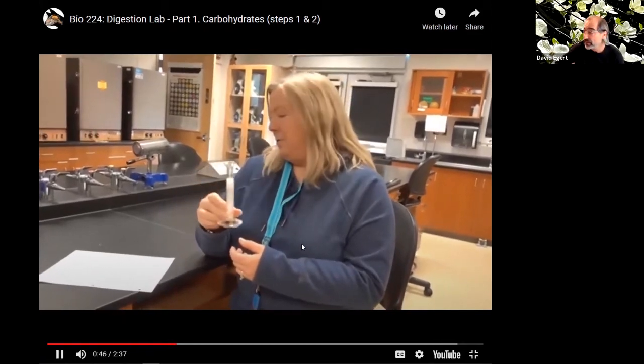Partly I'm showing you because in the data that you're going to see, it really is Becky's spit. This isn't just made up, theoretically. When you see the results that are happening, it's from some factor that actually is in Becky's saliva. That's why we're making sure you see this, since obviously you're not actually spitting and watching your own spit do the magic. We're going to be using this not only for the spot plate experiment, but also for the 5 tubes of the carbohydrate digestion.